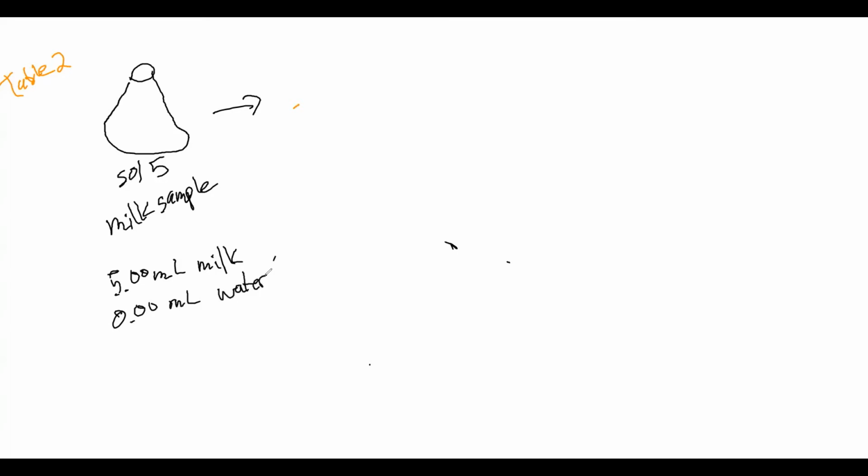Now on this next part, it's a little bit different. This time, when we move into our next solution, instead of giving us our concentrations as a number, since we don't know those concentrations, they're given to us in the term of a dilution factor. And so what that tells us is that when we get into solution 6, we know that solution 6 should be 1 to 100 compared to that of solution 5.